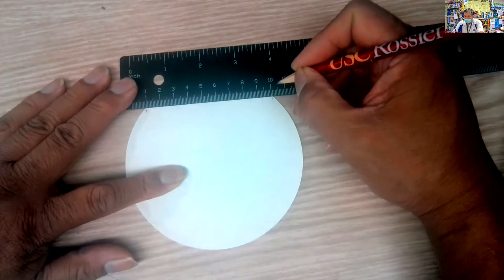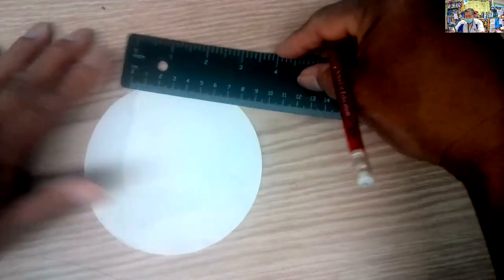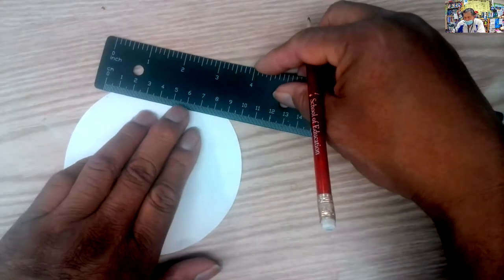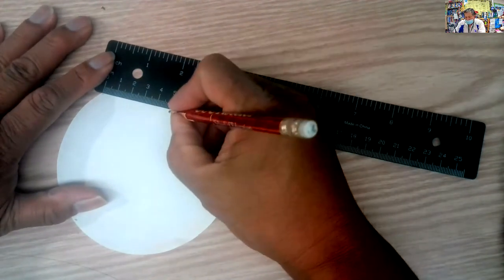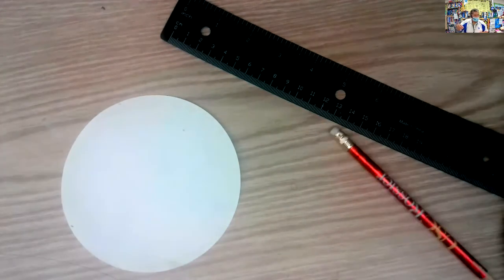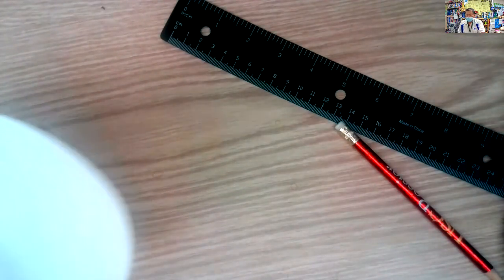And then the directions say 5 cm. So I could actually cut a 5 cm strip if I go across this way. 5 cm from here. It's not crucial that it's exactly right, but I'm going to do it as best I can, so we can follow the instructions and minimize the variables that we have.